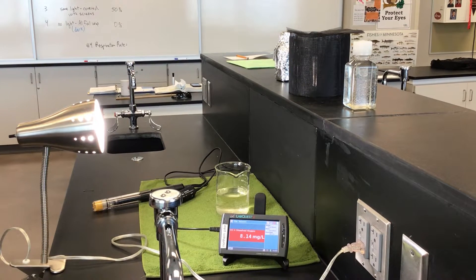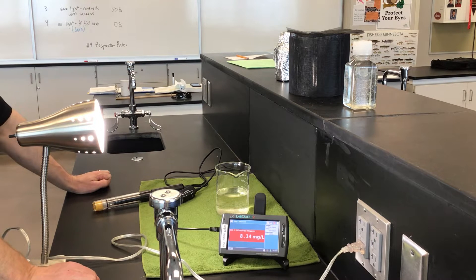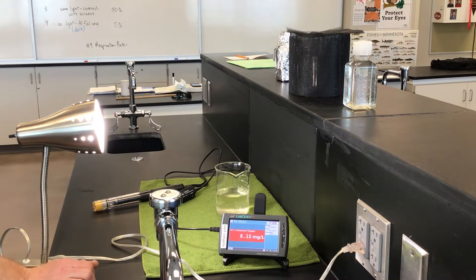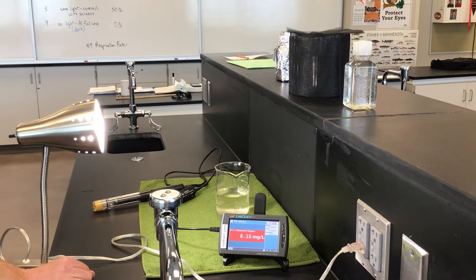Hey, this is Mr. Buss and I'm going to go through the AP Biology primary productivity lab. This video will be in two parts. The first part that you're watching now is me talking about the setup, and the second part will be looking at the results and answering some questions.